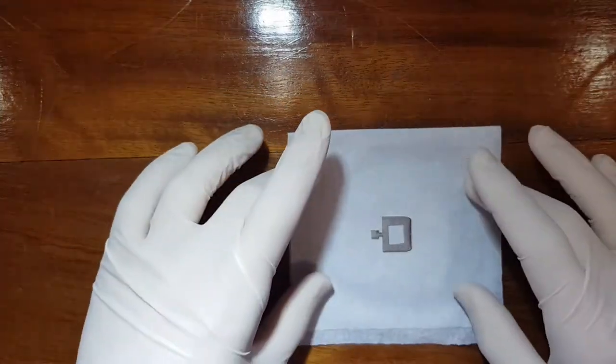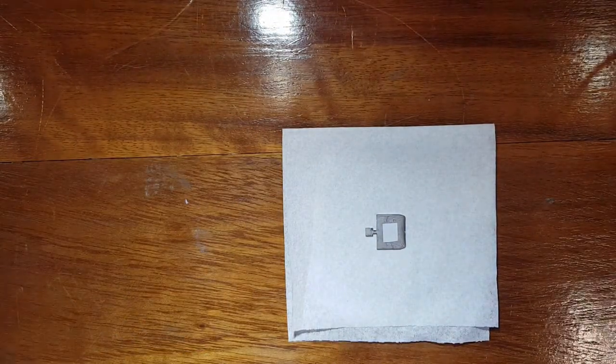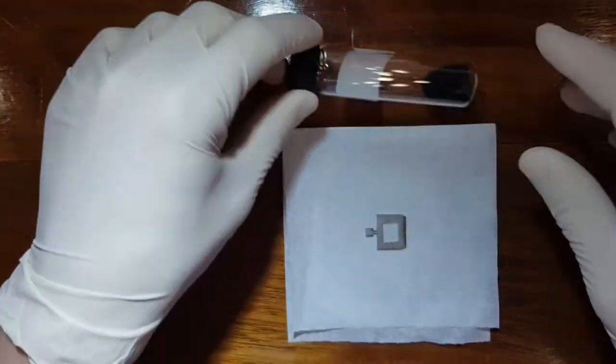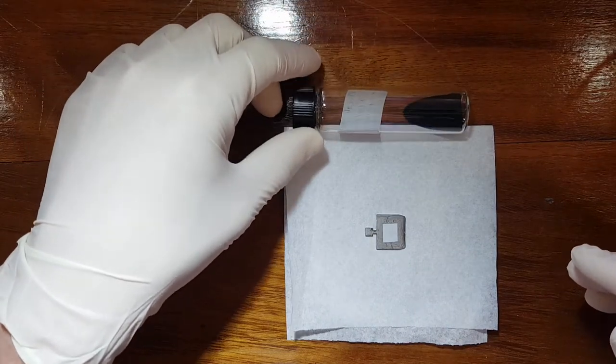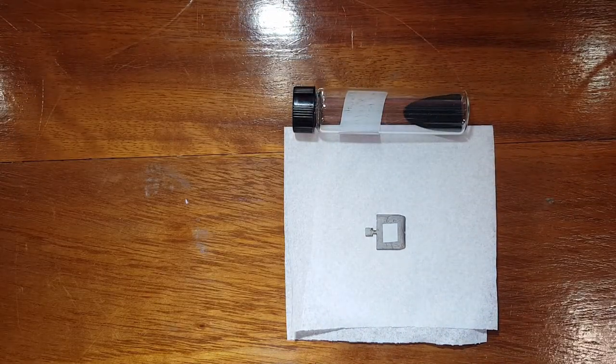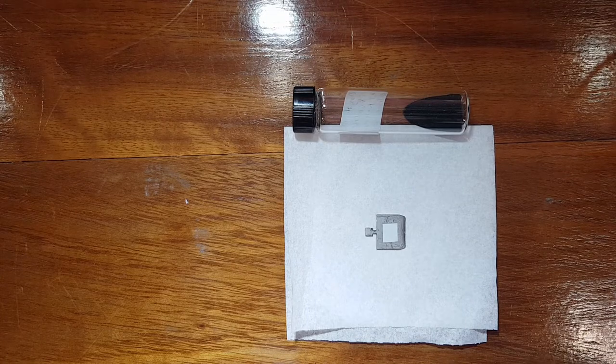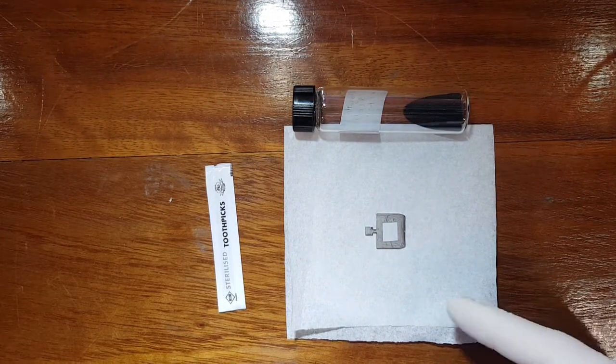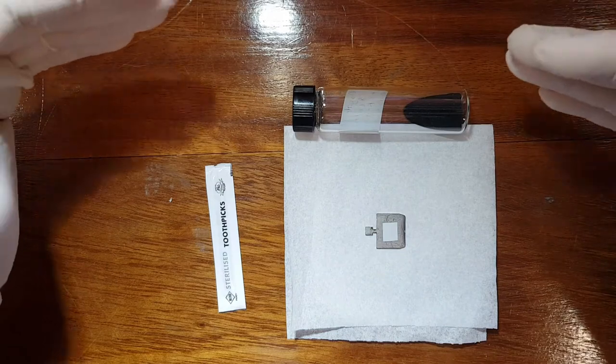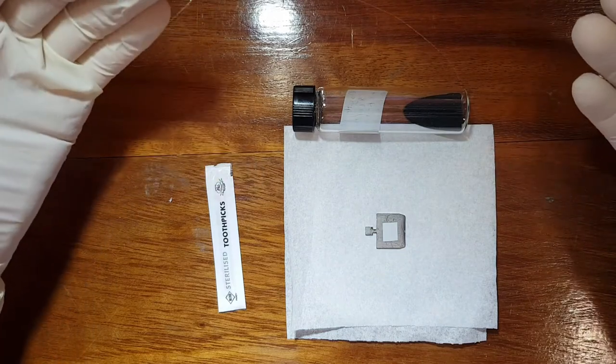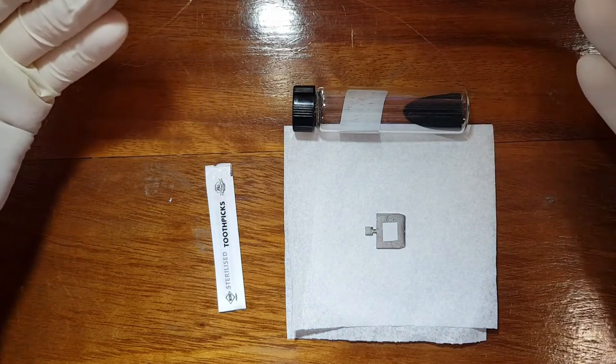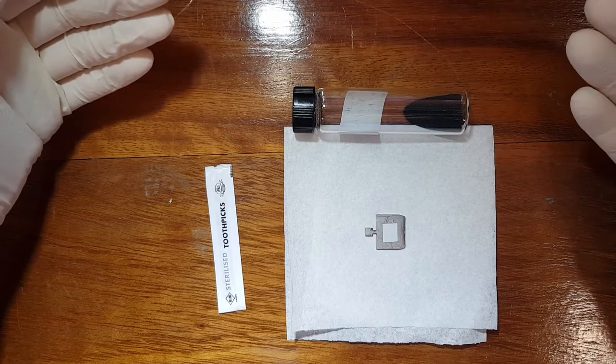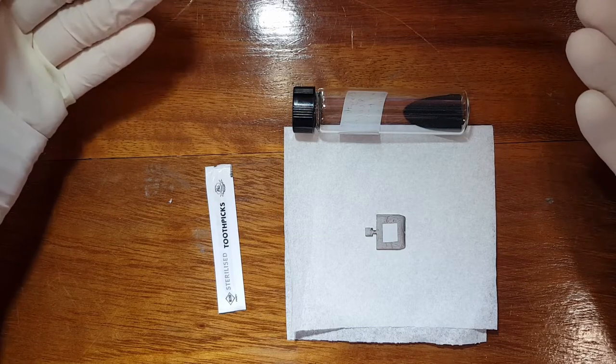Now before we begin we will obviously need the sample, which there we go, that's a sample we'll be installing onto the sample holder. And then we will also need some sterilized toothpicks. We use these just to make sure that we are distributing the sample onto the sample holder evenly. Now I suppose you could use a tweezer or you could use some other implement, but then you'll have to sterilize the implement after every mounting of a sample. And if you have a hundred samples to mount, then you're going to be in for a very long day.